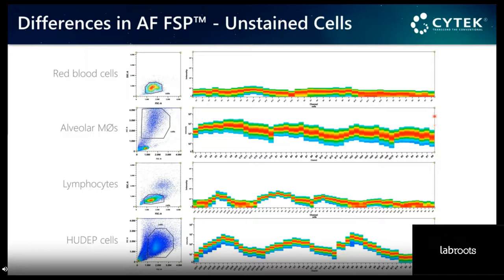And the critical point is that now within the plot, the space that I'll have to characterize the real fluorescence from fluorescent dyes, from fluorochromes, is less, and that's where it's so critical to do extraction of this light to have it as your 0. Lymphocytes, we already talked about them, discrete emission.